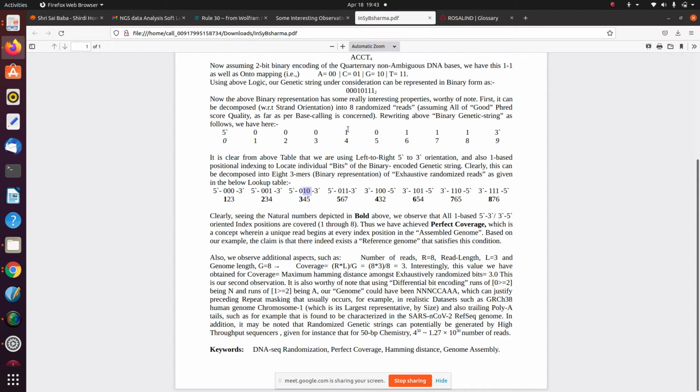Yes. So if I'm going to count anything under both, then I don't count them again in forward and reverse. Okay, is that clear? Whatever I have counted for both, I am not going to count them again in forward and reverse. Okay. So how many forward and how many reverse? 2 plus 2, right? Yes. This is 2 3 4, 5 6 7 and that is 2 forward, and 7 6 5 and 4 3 2.